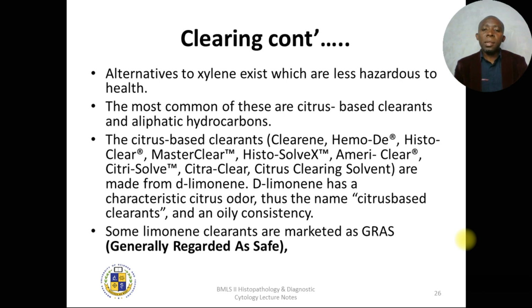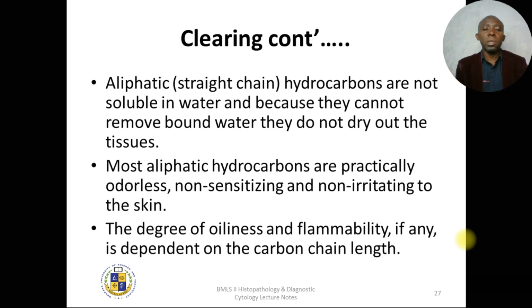Some limonene clearants are marked as GRAS, which is generally regarded as safe. This is a marker put on these limonene clearants to indicate that they are not carcinogenic, not very hazardous, and are good for use.